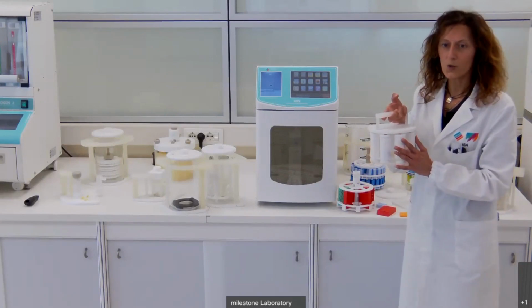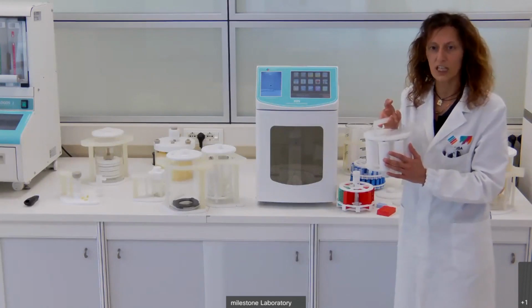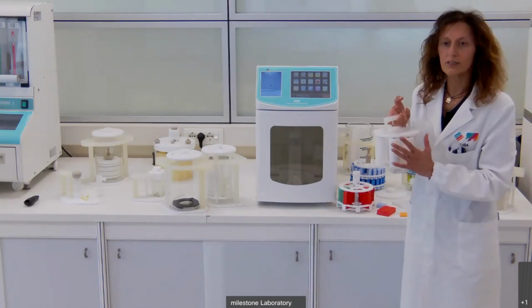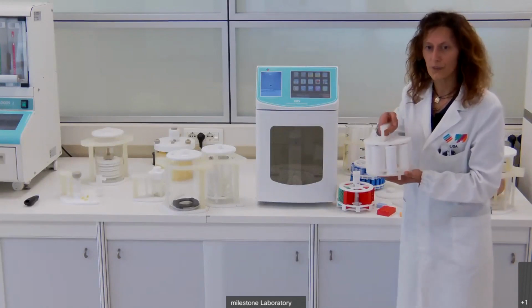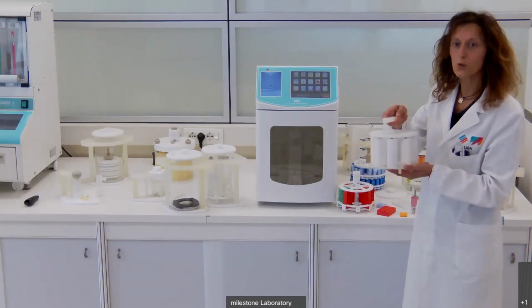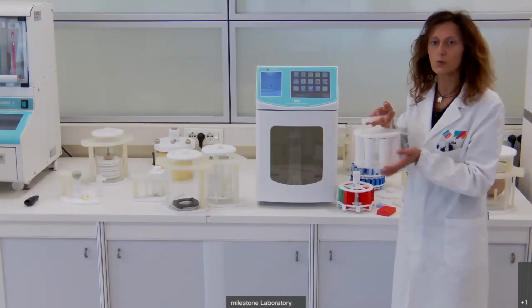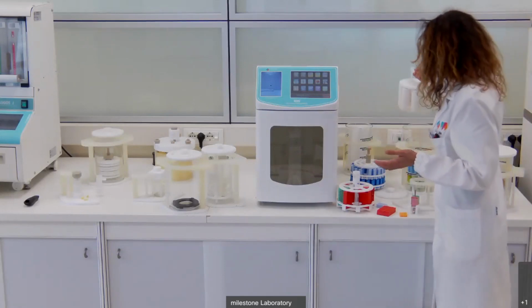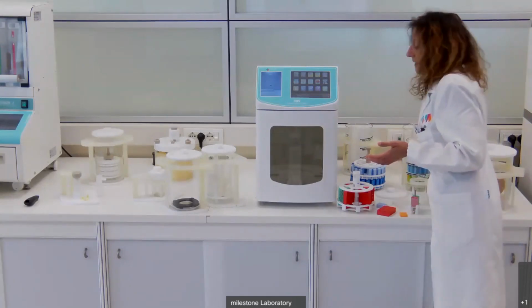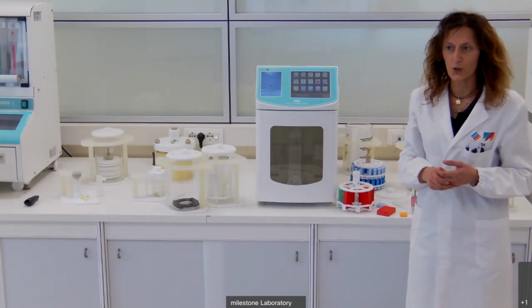In this way, you can decalcify in the same time different samples with different decalcifier reagent, avoiding the cross-contamination. As you can see, we always have the magnetic stirrer to maintain the homogeneity, the temperature from the bottom side to the upper side.